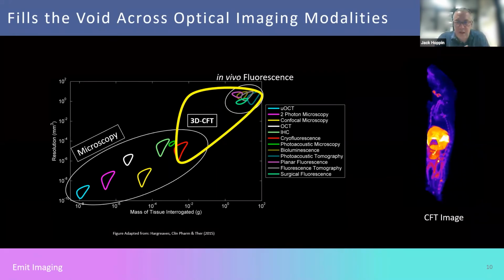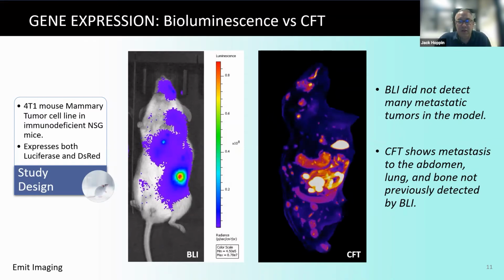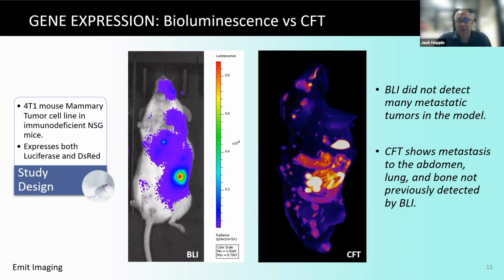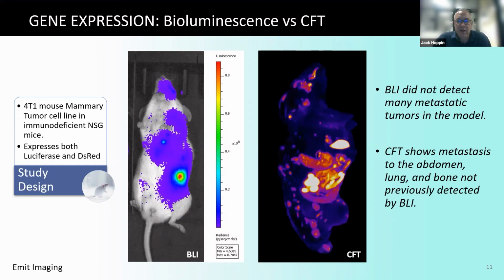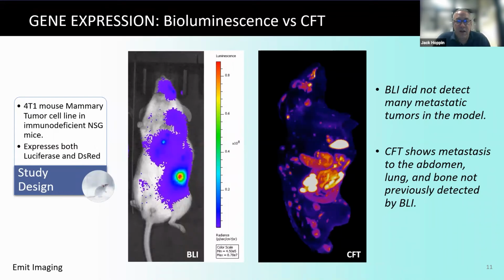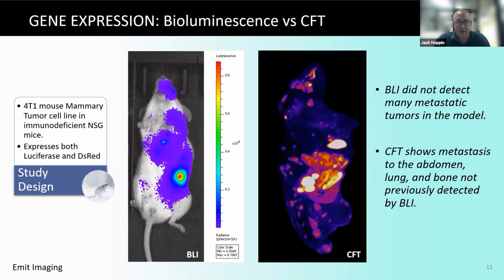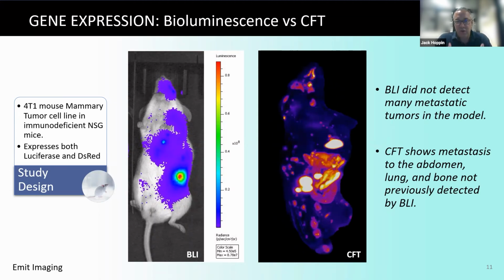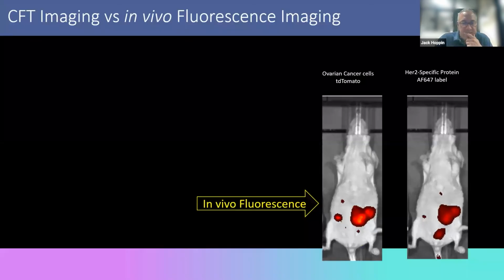So here is an example. We've shown some images, and just for context, I'm going to give a couple of oncology examples. On the left is standard bioluminescence imaging. Surface fluorescence images are in the same vein in terms of appearance. In this case, we have a cell line that could also do fluorescence. So instead of just a luciferin interaction on the left, we also had a cell line expressing fluorescence. You can see the dramatic difference. Now, of course, the image on the left is an in vivo image, and the image on the right is an ex vivo process. But you do have to ask yourself how much more information content we're seeing on the right, and how much we miss on the image on the left. It's striking.